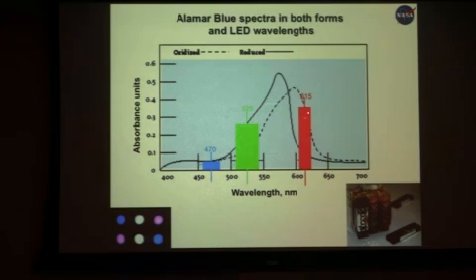Our optical system measures at red, green, and blue wavelengths. That's all this shows. And we have this dye in there that's blue to start with. It looks like that. It turns pink over time. And then a little later, after it gets further reduced, it turns colorless.